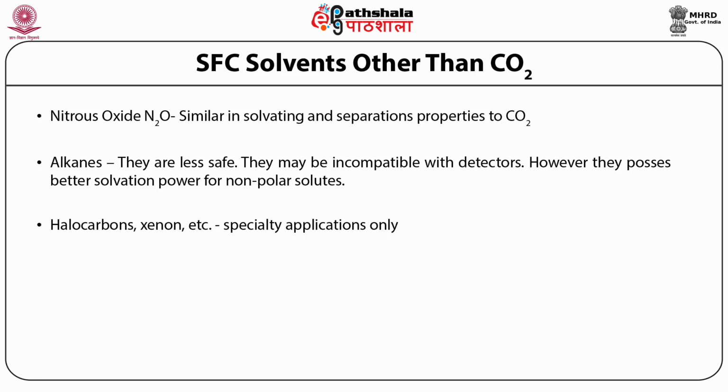More polar solvents are required for highly polar and high molecular weight compounds. Pure supercritical fluids as mobile phase are non-polar and polar solutes are typically insoluble in them. The highly non-polar nature of carbon dioxide is a serious disadvantage with respect to elution of polar compounds and biomolecules.